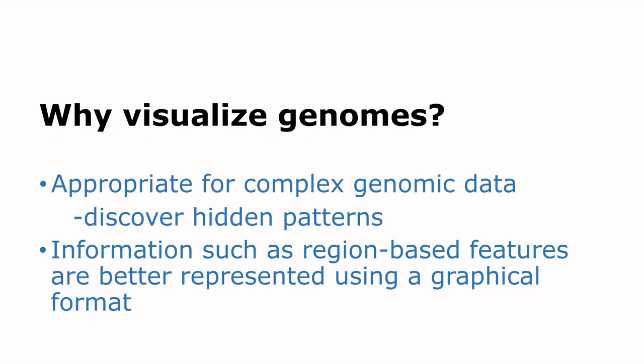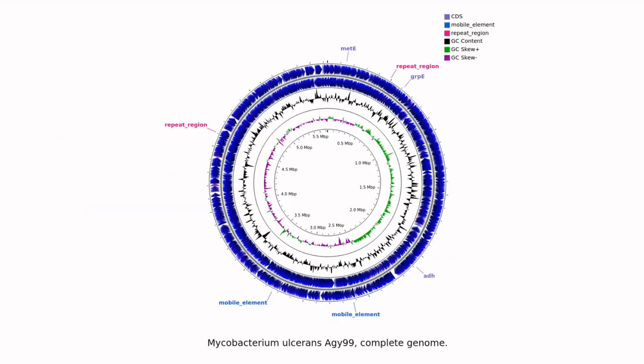And so for this tutorial, we are going to generate this cool genome map here, which is that of Mycobacterium ulcerans AGY-99 strain complete genome. So let's get started.